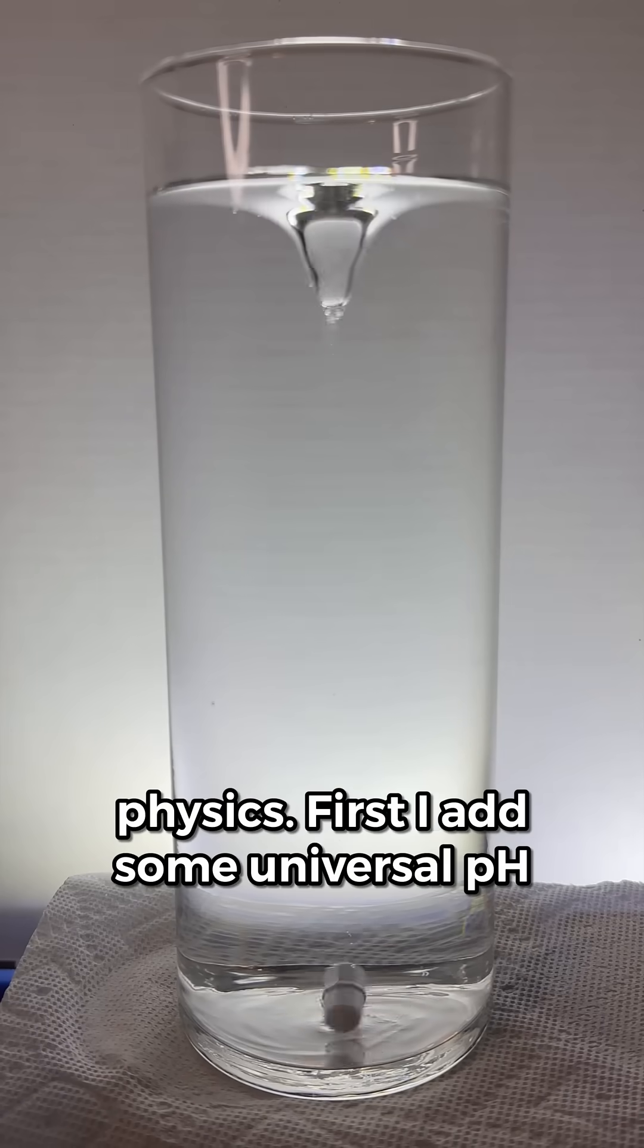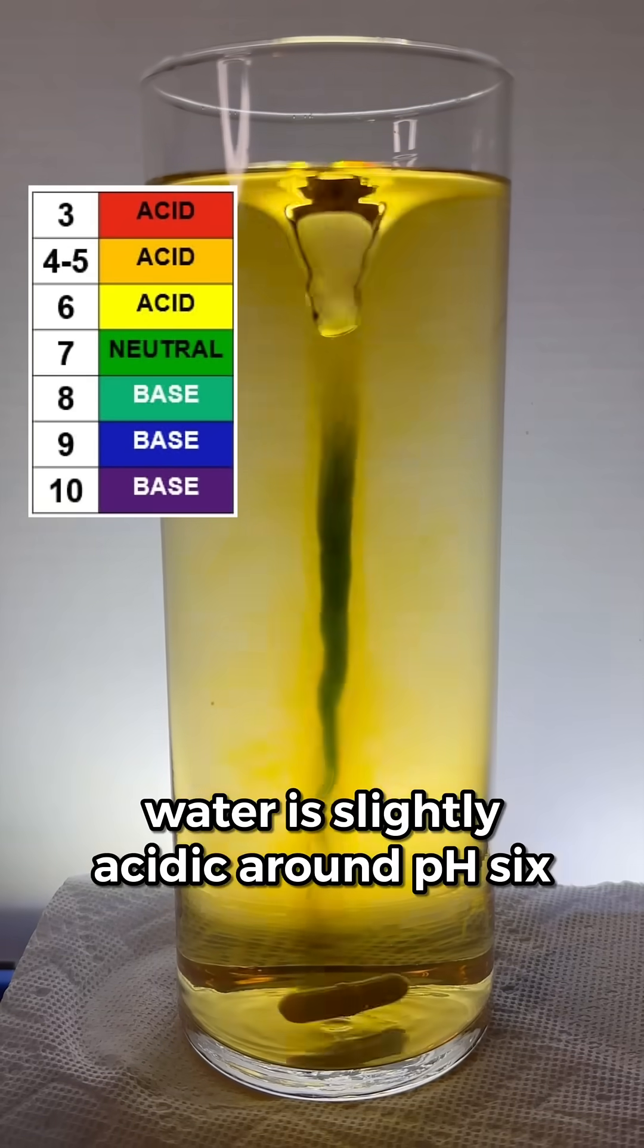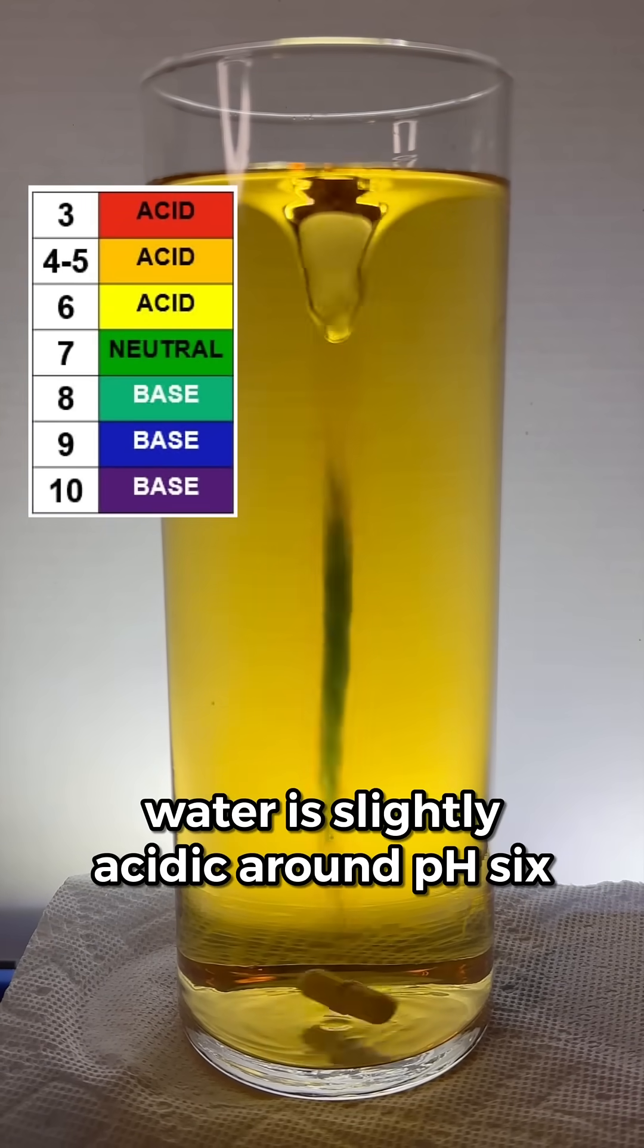First, I add some universal pH indicator to a cylinder of water. The solution turns yellow, meaning the water is slightly acidic, around pH 6.